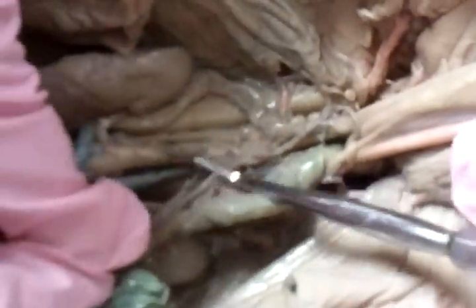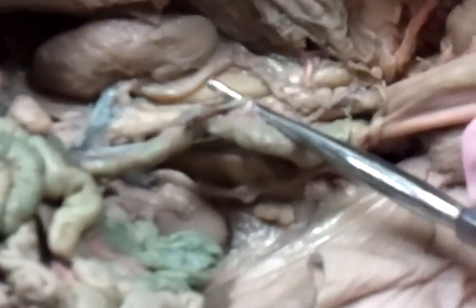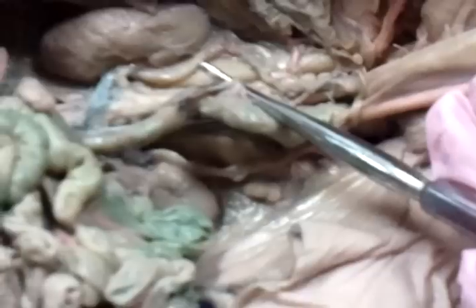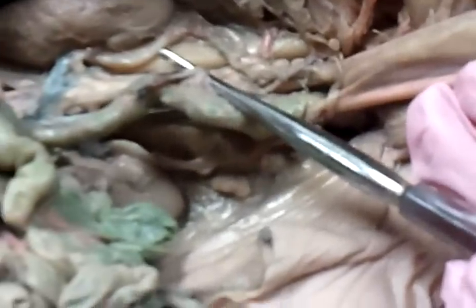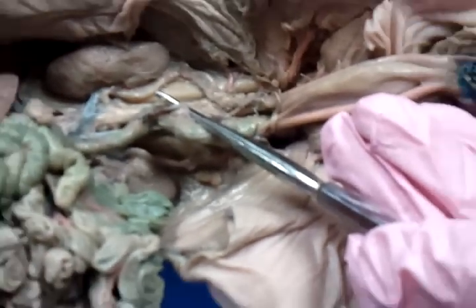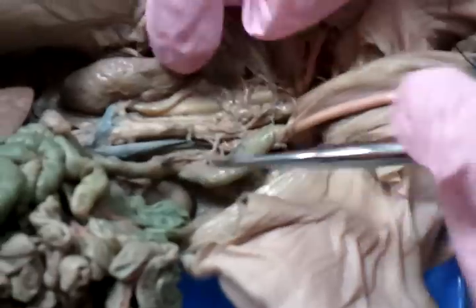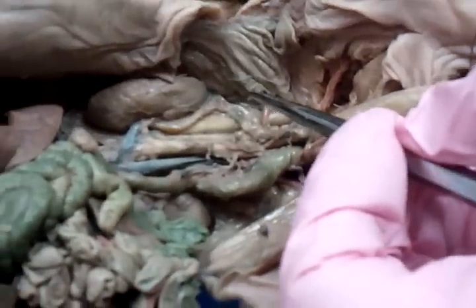All right, past that, inferior mesenteric. It's really thin right here. This guy coming off the aorta. The inferior mesenteric goes and serves the bottom part of the large intestine and your rectum. So it's a pretty thin single vessel, and if it's going to the large intestine, that's how you know it's your inferior mesenteric.